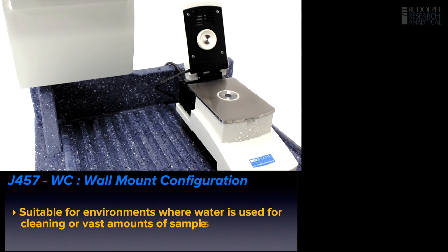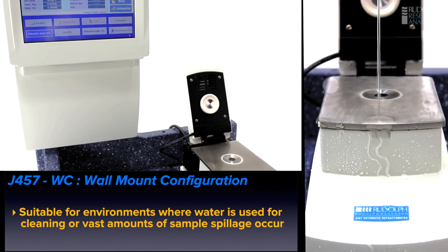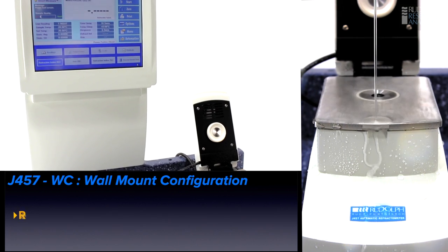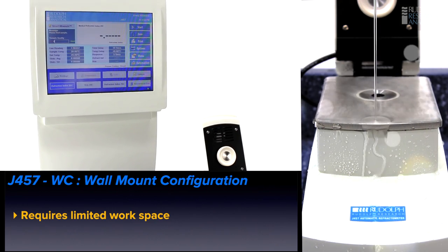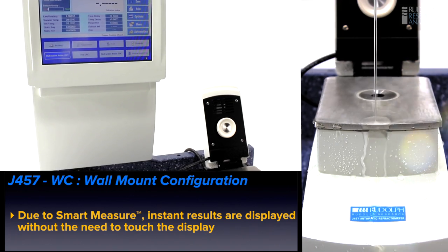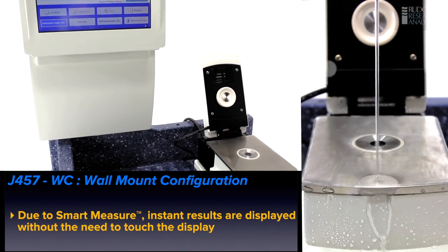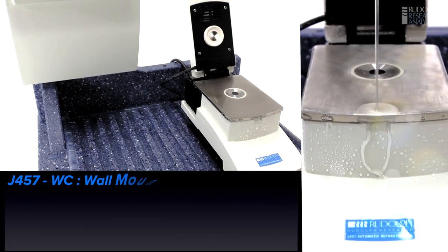Other situations may dictate the use of the J457WC. This is a unit where the display is mounted on a wall and only the measuring instrument is placed on the bench and exposed to the potential spills and liquid. It's also worth remembering that this wall-mounted unit works with the SmartMeasure system such that measurement can be started automatically — no one needs to touch the display unit.